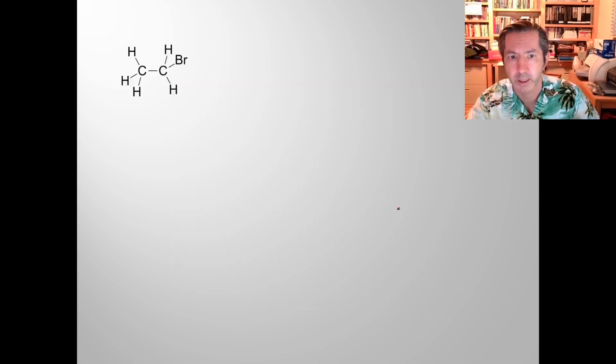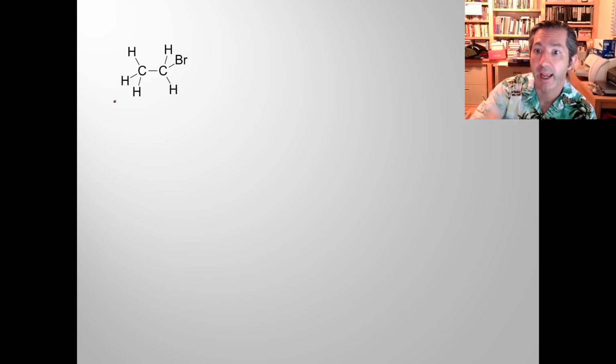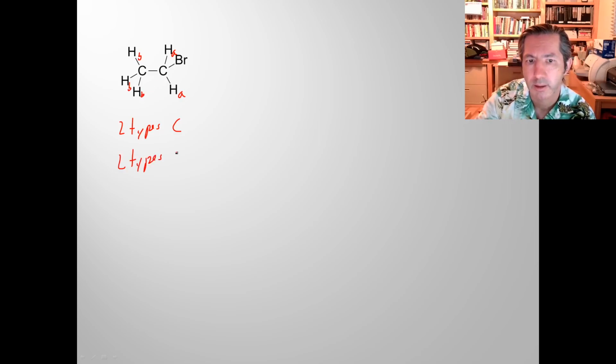Let's take a look at another one here. And we're just going to look at numbers of types of carbons and hydrogens. And you can pause at each new structure and try to figure it out yourself too. See where our answers match. So try pausing, writing down your answer, then unpausing. But let's look here. We've got carbon next to bromine, carbon next to a carbon next to bromine. There are 2 types of carbon. There will be 2 carbon signals. Let's look at our hydrogens. There's hydrogen that's 2 bonds away from bromine, or 3 bonds away from bromine. 2 types of hydrogen.